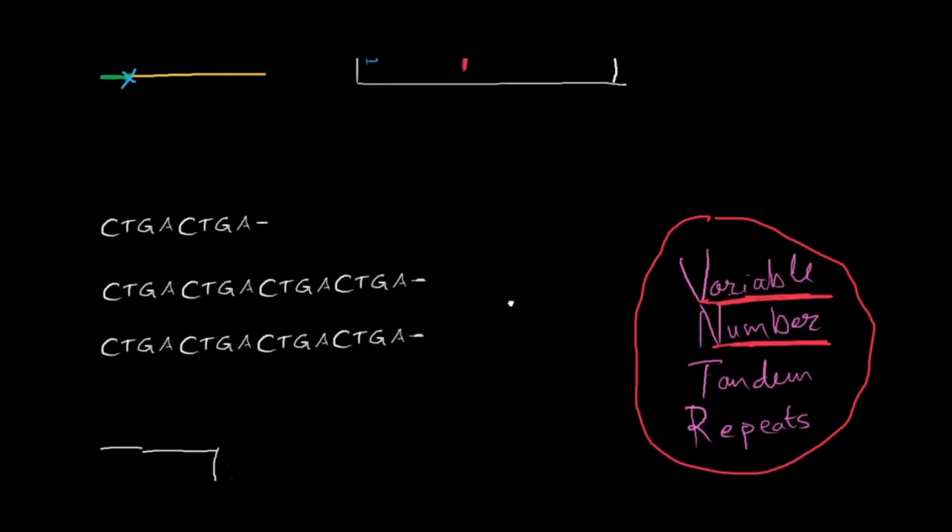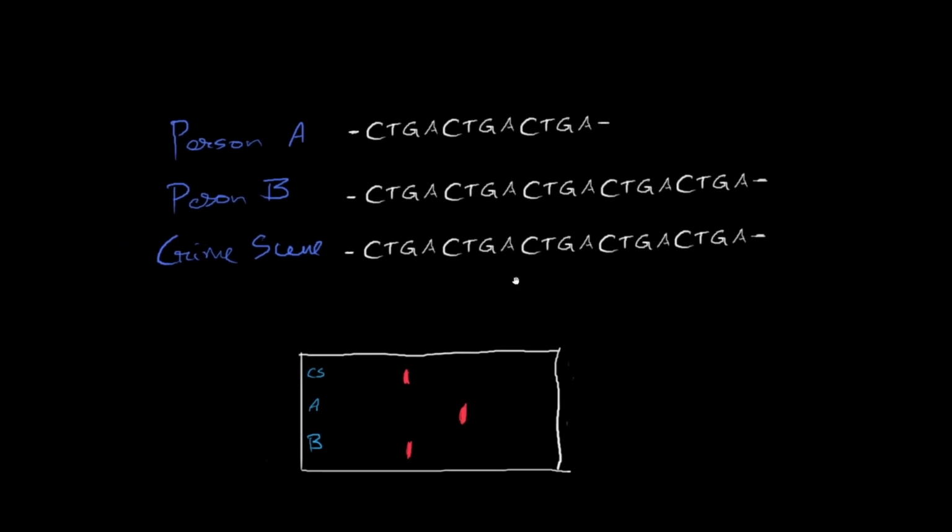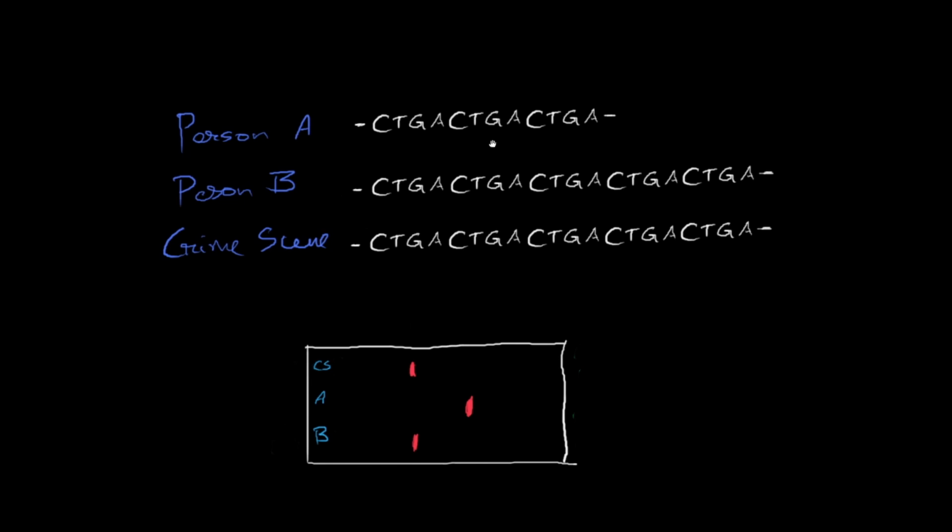Okay, so now we have this almost surprisingly convenient setup that can actually work in our favor, and this is actually how the earliest versions of DNA fingerprinting exploited this concept in the human DNA to selectively visualize only the very variable regions of human DNA.